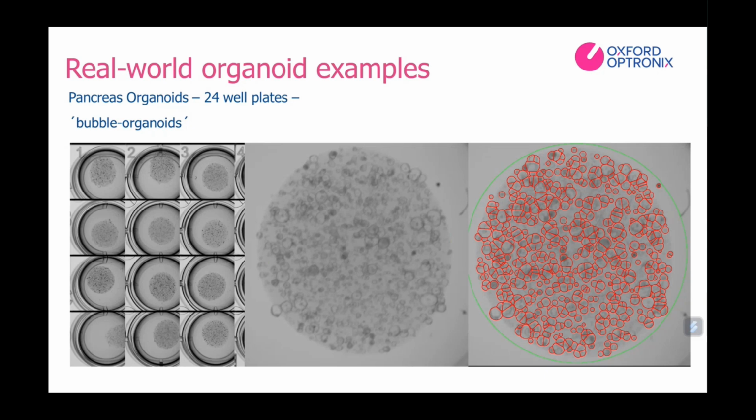And again, here's the second image. And our suggestion, while we can count this, would be that these images perhaps should be taken when the organoids are smaller, or if they need to be seeded to this rate, that they be seeded a bit less or the domes are made a little bit larger. But again, you can see how we are able to get counts here where somebody manually very likely would not be able to.